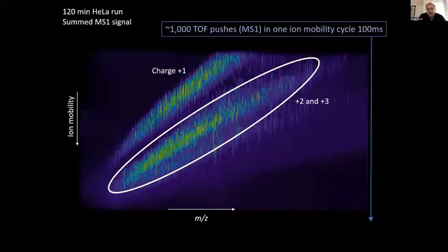Okay, and again, compressing a couple of questions. You talk a little about the data analysis side. What are the standard tools that people use, like Skyline and MaxQuant, practical for this sort of data? Is Spectronaut an option for this data as well?